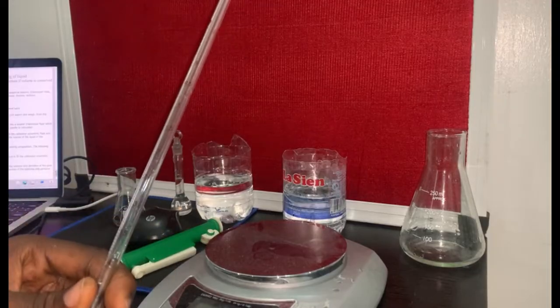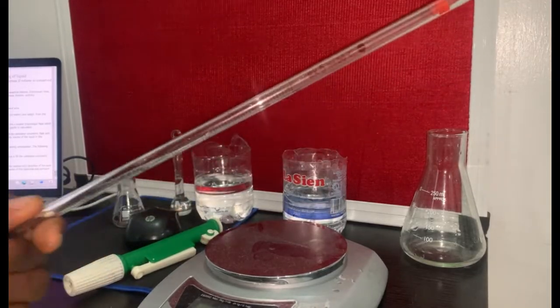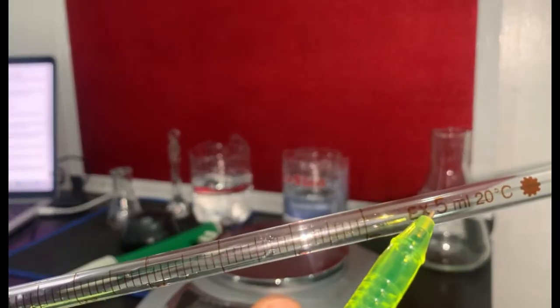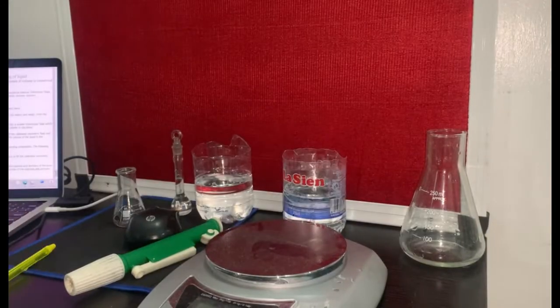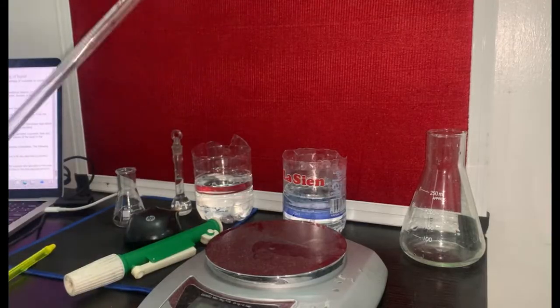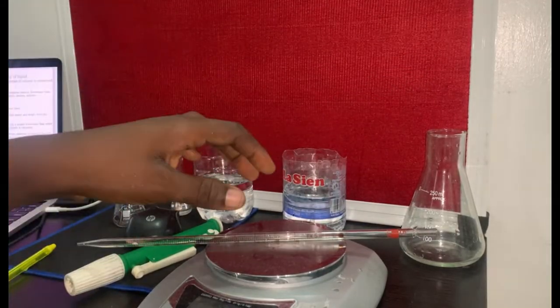So this pipette here, we're told is 5 mil. If you look at it very well, let me show you, there's 5 mil here. We are told that this is 5 mil. So we want to verify if truly this is 5 mil. But unlike the volumetric flask, we cannot weigh the pipettes when it is empty.